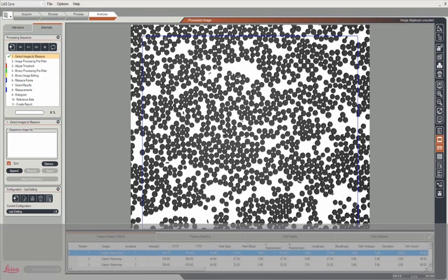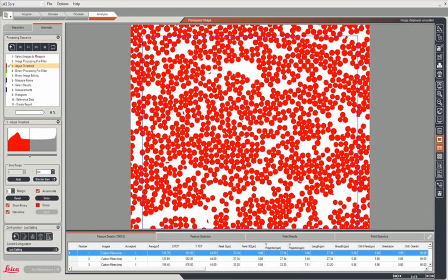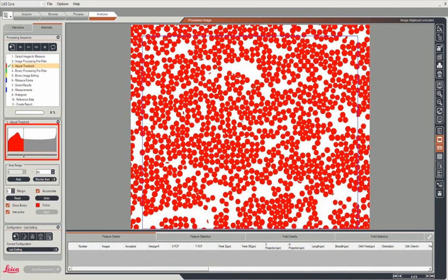Again, the image analysis can be used to overcome these problems. We start by setting the thresholds as we did previously. As shown before, you can select the threshold. You can adjust it manually, or more accurately, you can simply click the Auto button, and that sets the threshold that estimates the correct level to use.